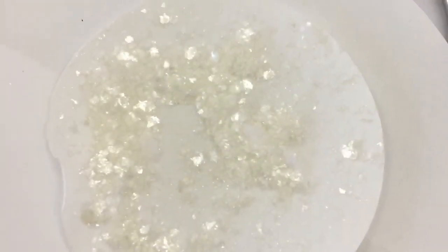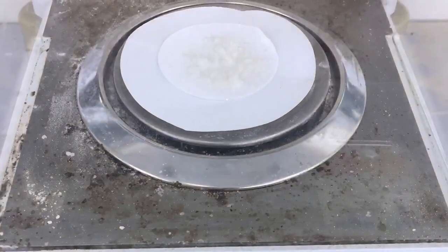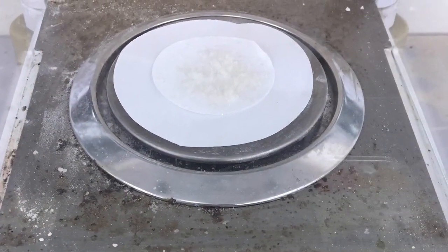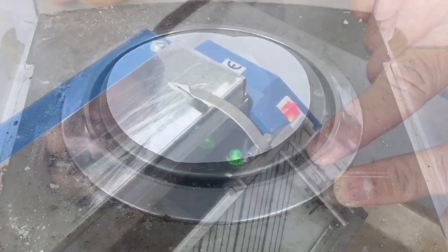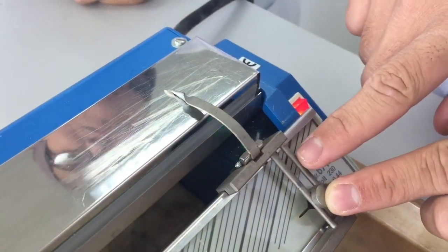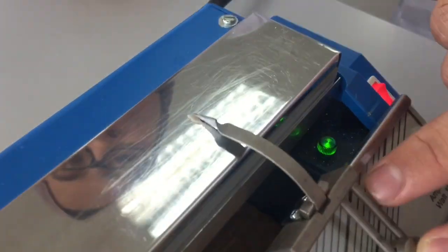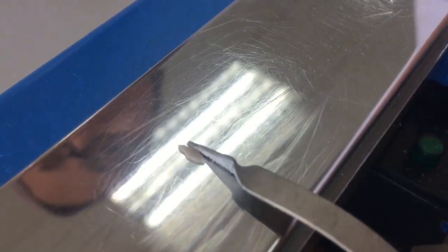The result from filtration was transferred to a dry filter paper, which is weighed first, and the result found was weighed. The melting point of the pure acetanilide was determined by the melting temperature measurement.